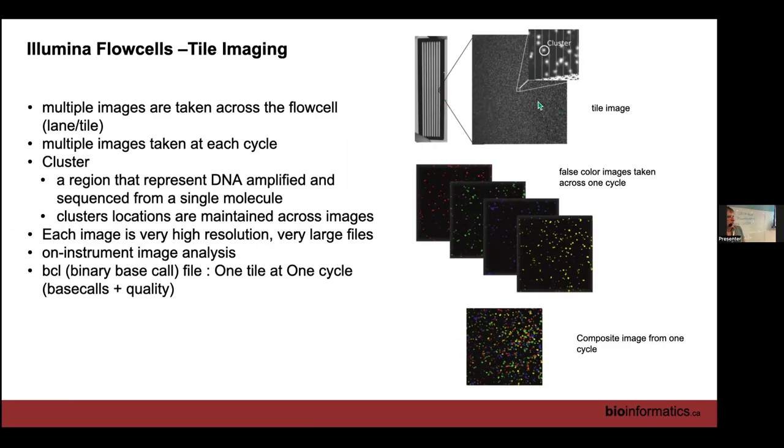And part of the QC in that FastQC tool is to look and see if the representation of issues or noise is uniform across the tiles. If for some reason we saw one set of tiles down here where there's a lot of error, a lot of noise, that tells us maybe something's wrong with our flow cell, or something's wrong with our sequencing itself.